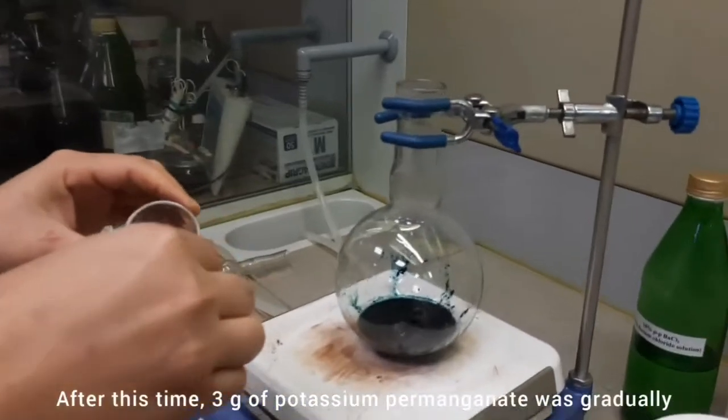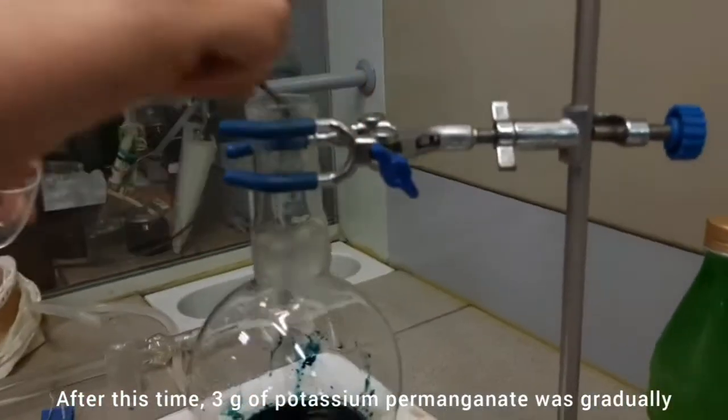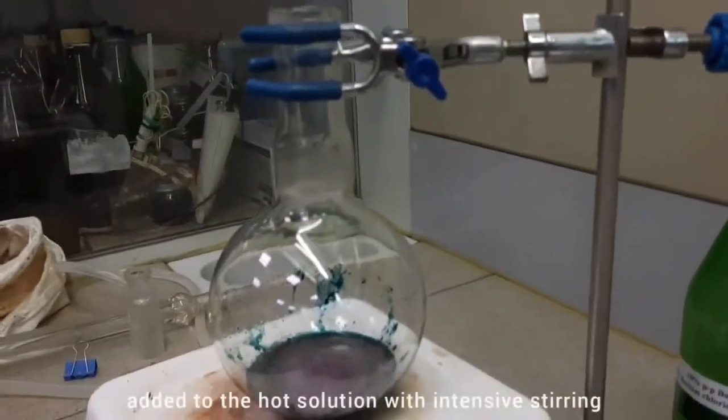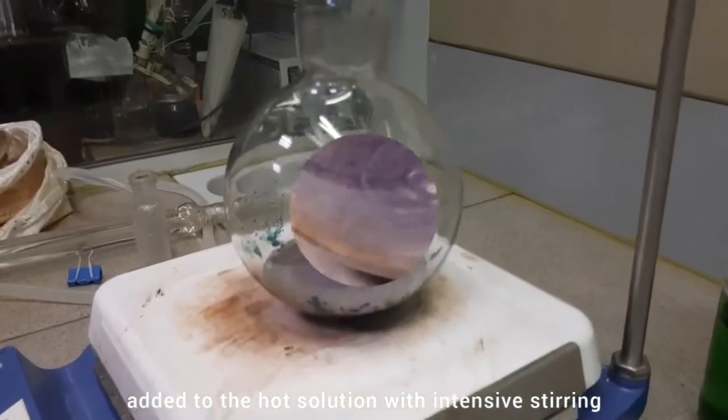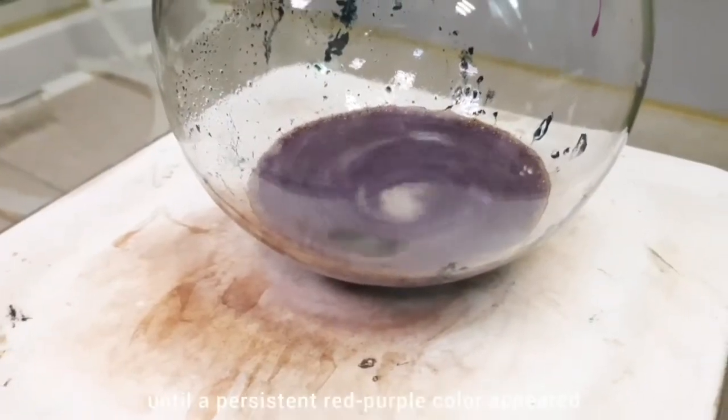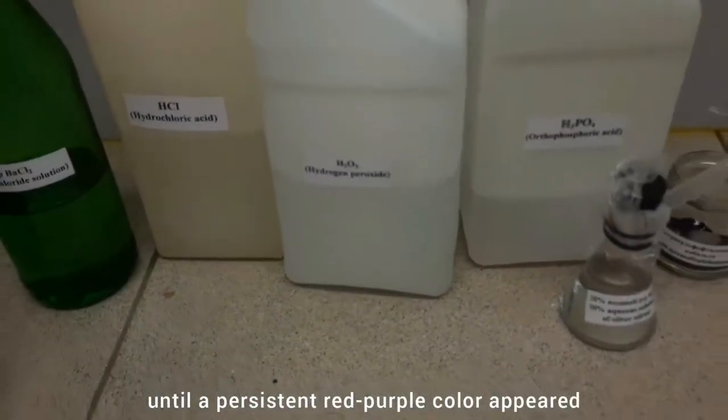After this time, 3 grams of potassium permanganate was gradually added to the hot solution with intensive stirring until a persistent red-purple color appeared.